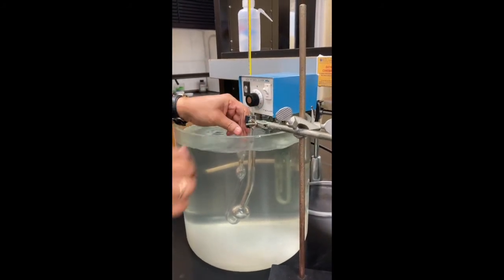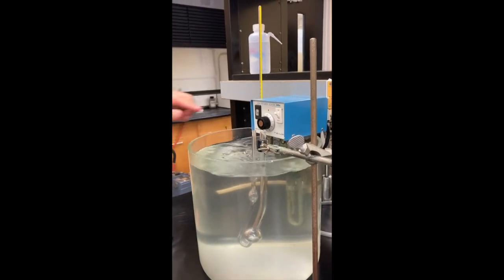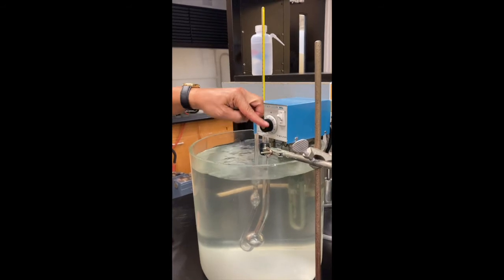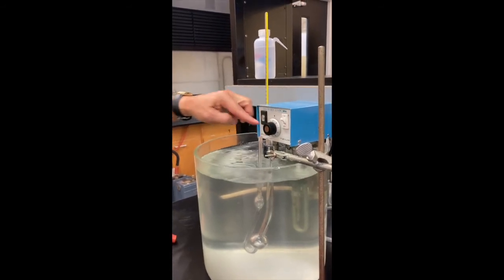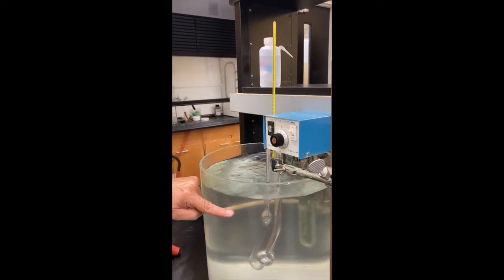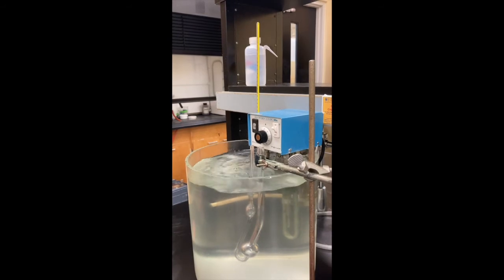So now we are ready for measurements. We will pour our solution or water here, then suction it above the upper fiducial mark and let the liquid flow and take the measurements of it.